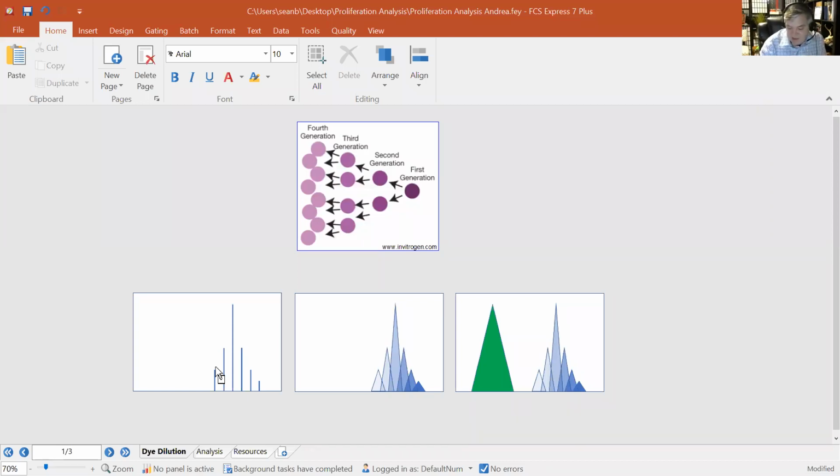One of them is that a lot of these dyes are actually cytotoxic to your cells. If you load your cells with CFSE, you might get a very bright starting generation and be able to track more generations. But if you put in such a high concentration that it kills those cells, or inhibits some biological function of those cells that you want to monitor, it's counterintuitive to what you're doing. So again, the core facility is probably a really good resource to talk to about how to perform these assays.